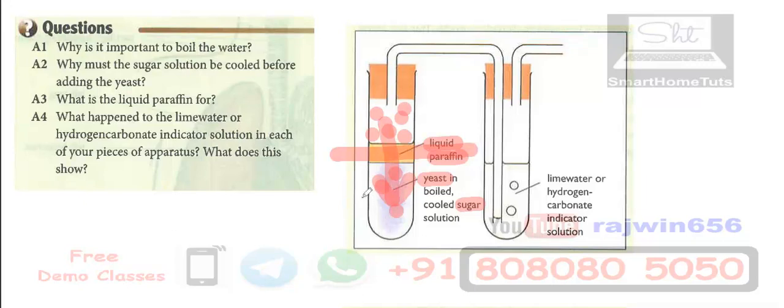Okay, so the answer that we are going to write for this is: liquid paraffin forms a barrier for air or oxygen which is above the solution in which the experiment is carried out. It forms a barrier for oxygen or air. Okay.